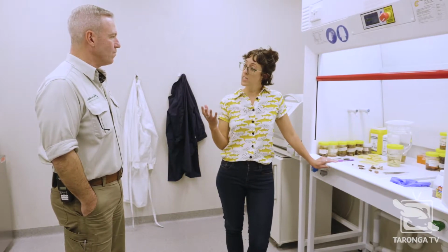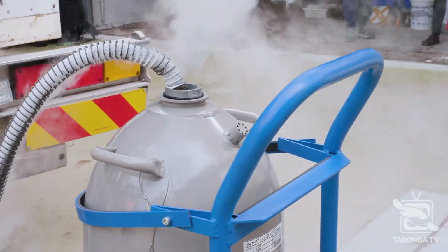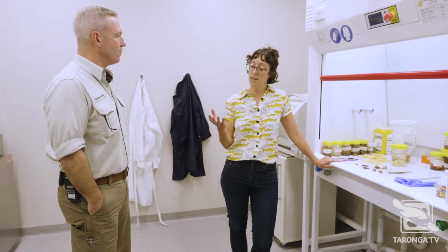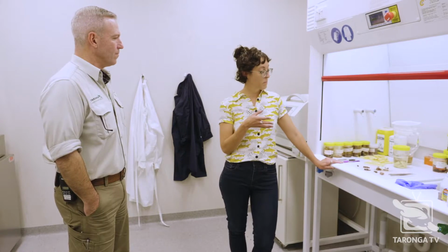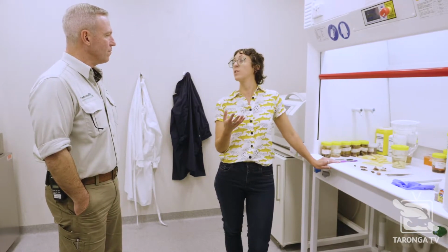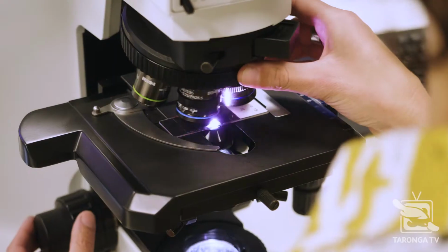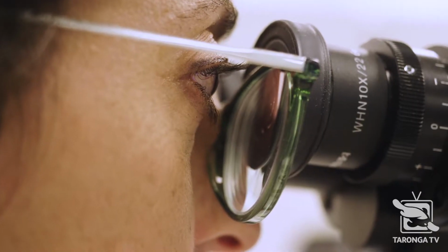So we'll have frozen tissues that we put into the freezer, and those can be used for microbiology, for toxicology, for asking all sorts of questions down the line. But what we do with the formalin-fixed tissues is prepare them in small cassettes so that we can have them processed, and I can eventually look at all of these tissues under the microscope at high magnification and start to interrogate at a finer level of detail what has actually gone wrong with that animal.